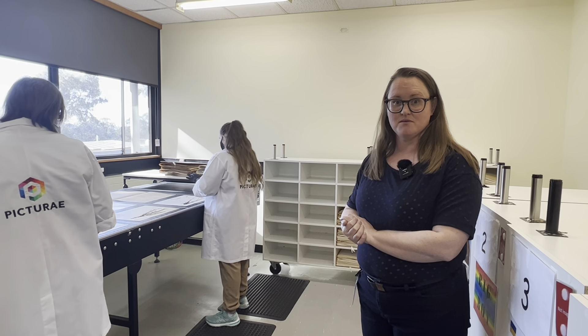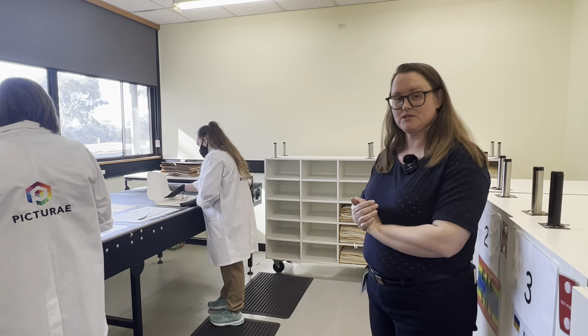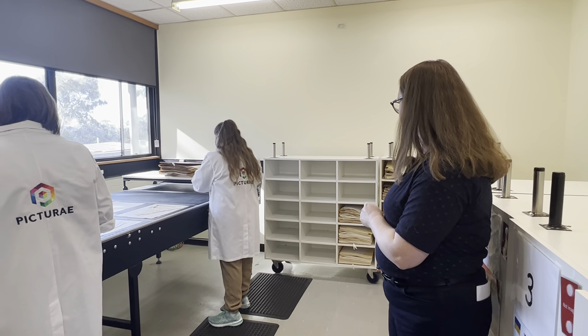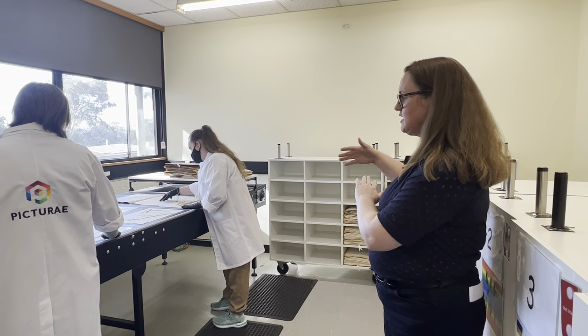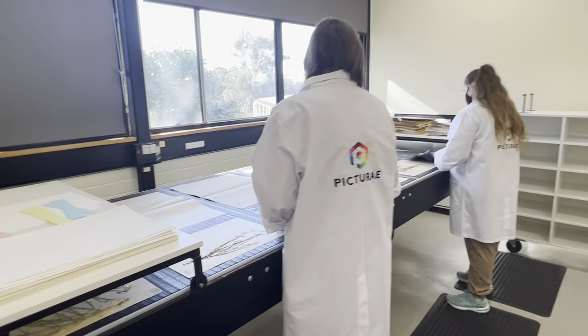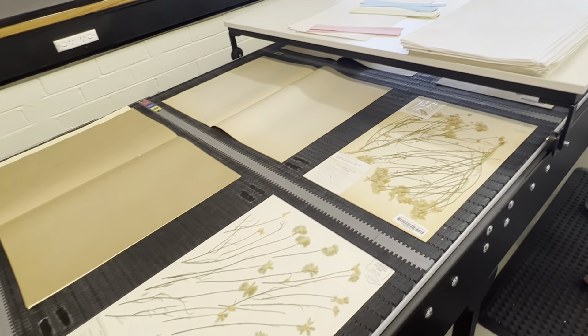We're imaging herbarium specimens in this room. The process involves taking specimens out of our collection and putting them into these trolleys. Each pigeon hole is deconstructed on the conveyor belt so every specimen is laid out, and they're checked to make sure they have a barcode.